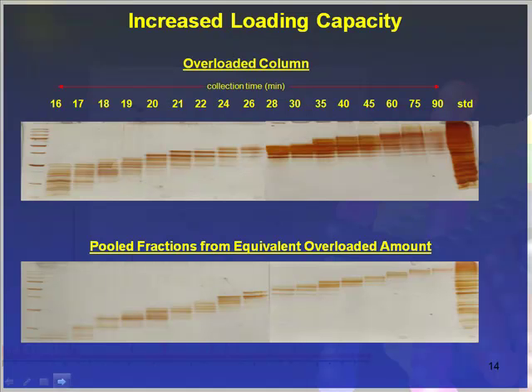Now, an interesting thing that you can do with the 8-channel device, taking advantage of that high run channel-to-channel reproducibility, is you can actually improve the sample loading. You can move it to a higher loading range.